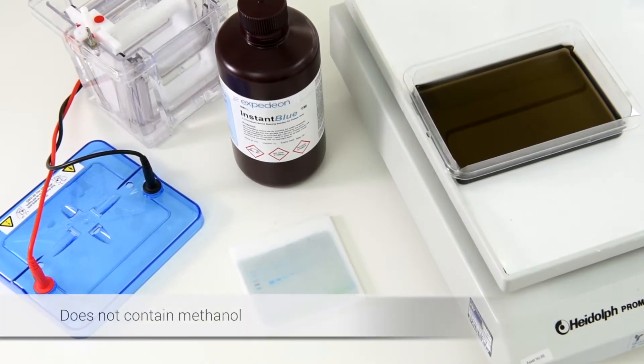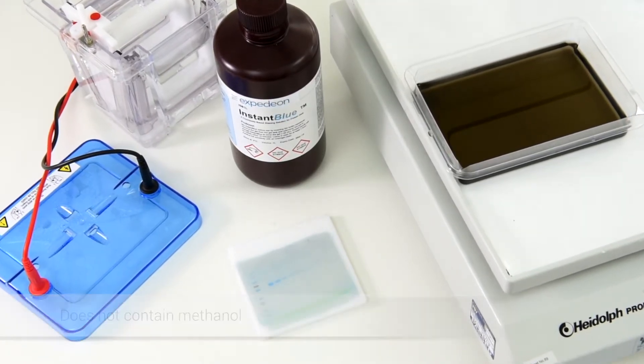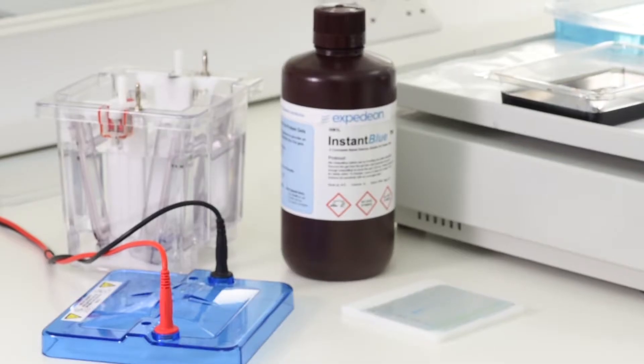InstantBlue does not contain methanol and therefore it will not shrink your gel. It is not toxic and you can dispose of it down the sink, giving you peace of mind.